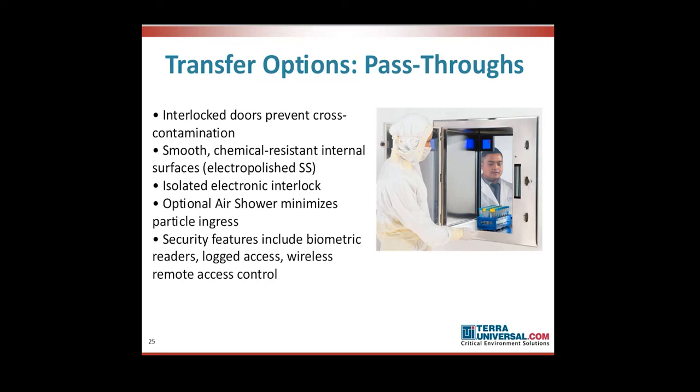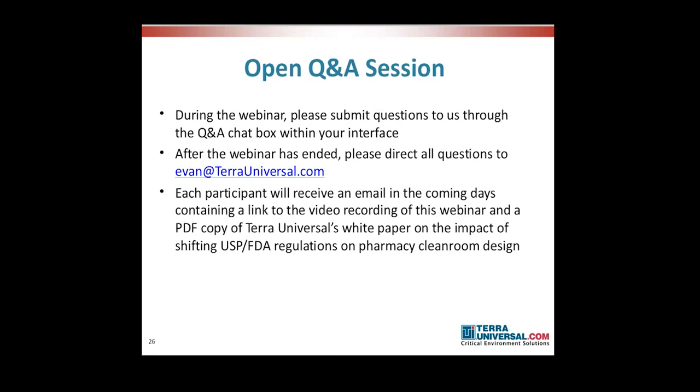So, in short, yes. As long as all of the ingredients are sterile, there's typically not a problem with low and medium risk being done in the same hood. What you probably want to avoid is doing them simultaneously, providing that you have a multi-operator hood. That would be a little bit risky. And of course, the exception would be with high-risk compounded sterile preparations, where of course you're going to clean in between each batch, and you would sterilize essentially all of your materials, both before, in between, and then after.